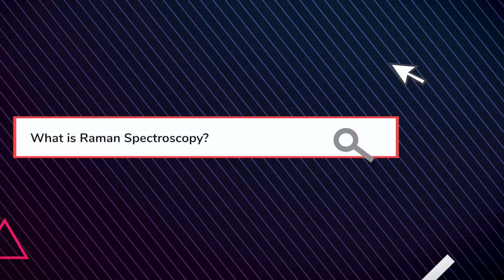What is Raman spectroscopy? Well, contrary to how many questions I actually get, it's got nothing to do with ramen noodles. For starters, it's spelled slightly differently. It's R-A-M-A-N, not E-N. Raman spectroscopy is named after the fact that the technique measures Raman scattering, and that specific type of light scattering was initially discovered by an Indian man whose name was Raman. So that's where the name comes from. Sadly, nothing to do with the noodles.